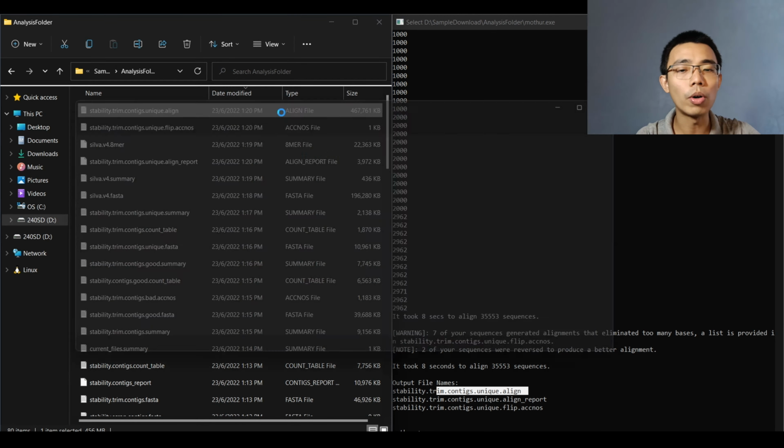They're kind of a FASTA file inside, which is being aligned to the reference, and these are how they're being aligned. So there's something like that, so you need to remove. That's not very important for now. You can again use a summary sequence to check your align file. You can actually substitute the FASTA file with an align file, and it would still work here. Okay, so we can check our align file using the tool processor.